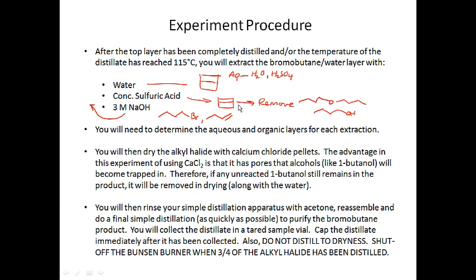You may still have some of this product formed, and in a few weeks you would see that that went away with the sulfuric acid, but I'm not going to discuss that now. So we'd have that product. We would also have a trace of H2O, and of course we'd have a trace of sulfuric acid.